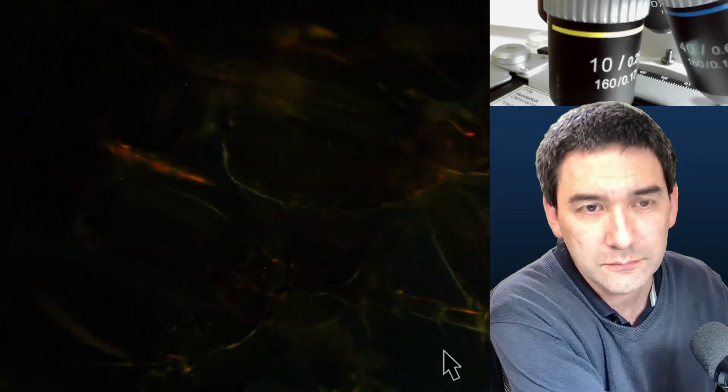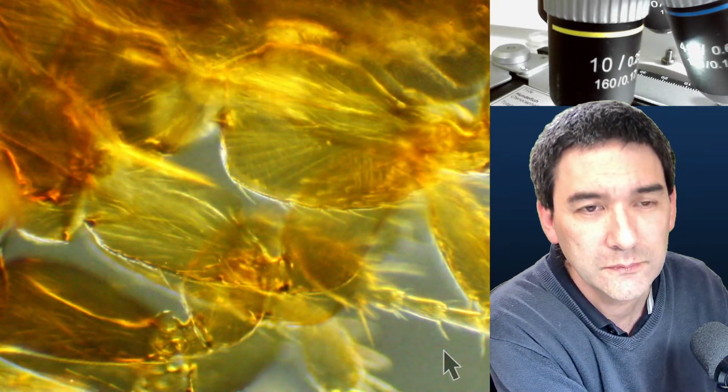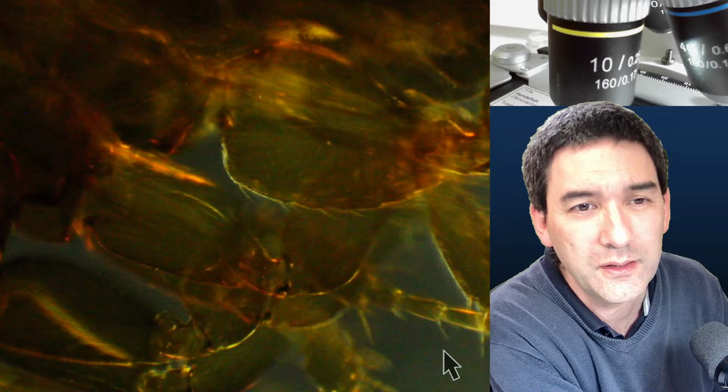Let's have a look. Okay, so I'm going to exchange now the filter with a dark field one. That's now dark field. And you see, it's kind of interesting. In dark field, the insect looks fairly transparent.